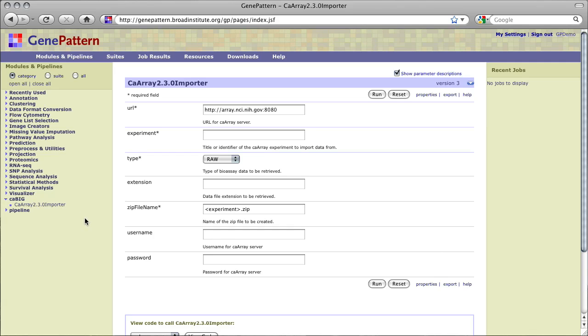CA Array 2.3.0 Importer imports data files from the CA Array 2.3 or newer repository into GenePattern by connecting to a CA Array repository and then retrieving files for a given experiment. The retrieved files are then collected into a single zip file archive, which is returned as the module's output. Note that though the module is named CA Array 2.3.0 Importer, it will work with the latest versions of CA Array as well.